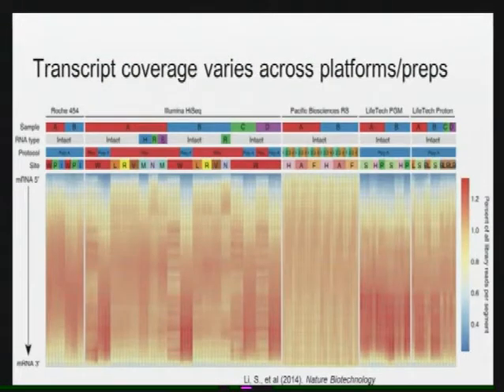Okay. So, coverage of your transcript. What you would ideally like to do is have reads that go across your whole transcript so that you can effectively quantitate it, and you're not particularly biased toward one end or the other. So this is really, I thought, an interesting plot showing how that changes across the technologies and with the preps.